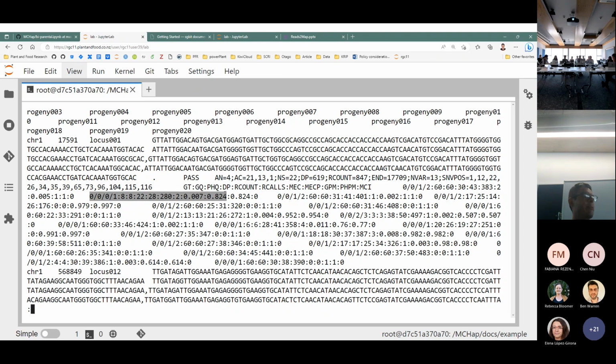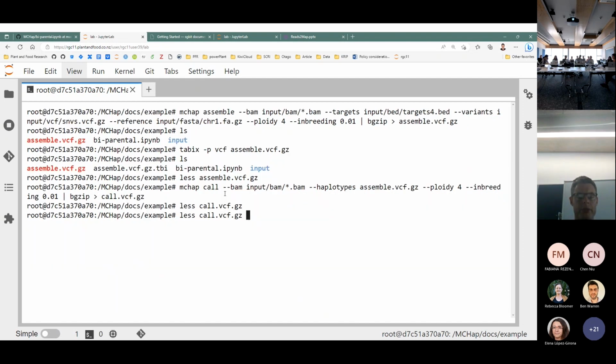If you have really high read depth and really quality data, though, that may actually be enough because it's a Bayesian approach. The more information you have or the more information you've put into it, the less effect the prior distribution has on the posterior distribution. There are arguments in here that you can use to put out more information about the posterior distribution.